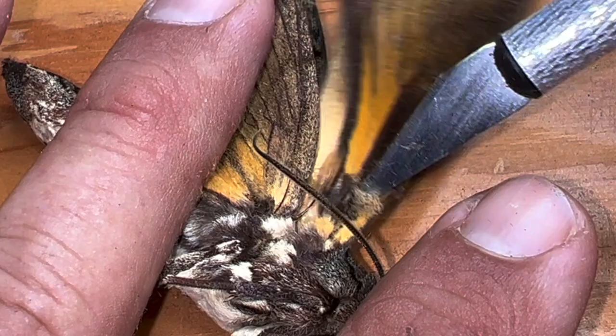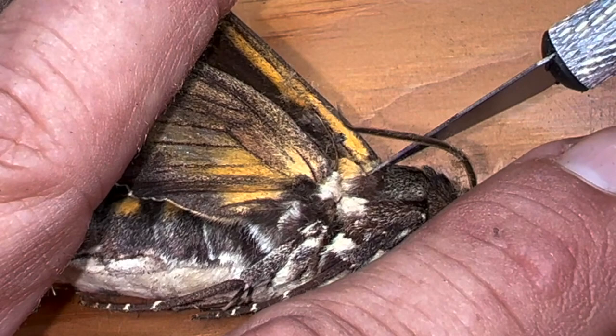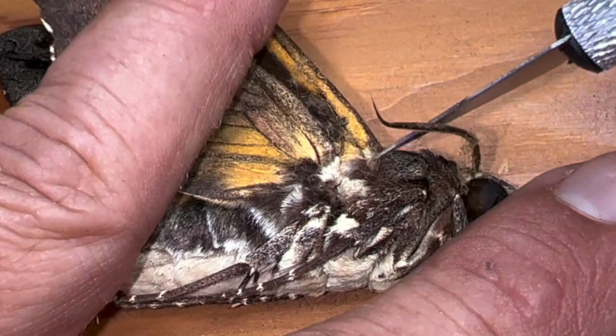We're going to sever that tendon, and when we do, the wing will be a lot more flexible. You want to make sure you don't cut the joint — the joint is right here where the wing joins the thorax. If you cut the joint, the wing falls off, and you don't want that to happen. The actual tendon is different from the joint.